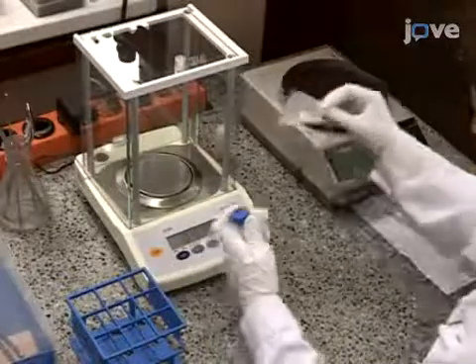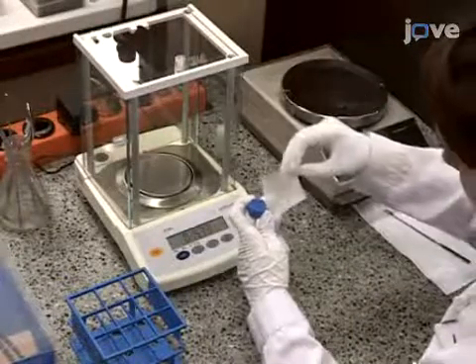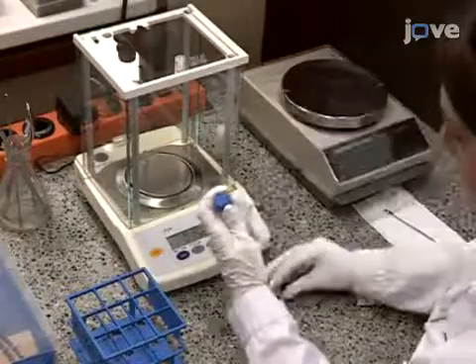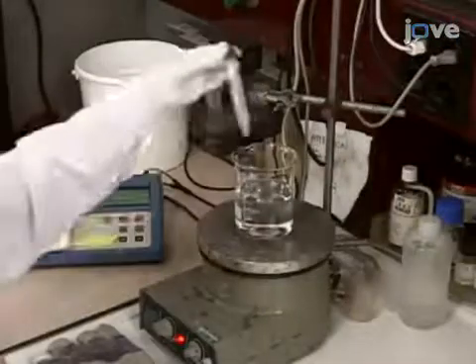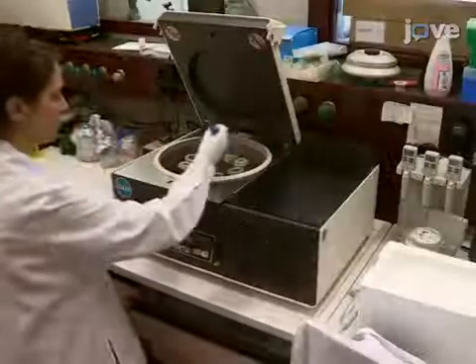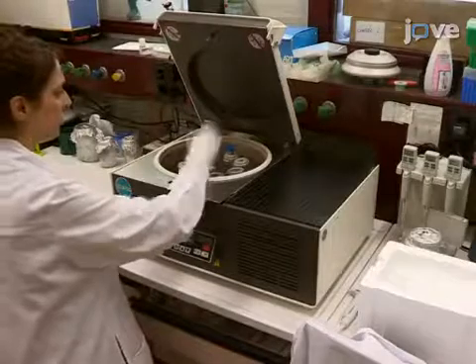To begin this procedure, add 20 milligrams of dried zymosan to 10 milliliters of sterile PBS, vortex, and heat in a boiling water bath for 10 minutes. Then cool and centrifuge at 2,000 Gs for 5 minutes.